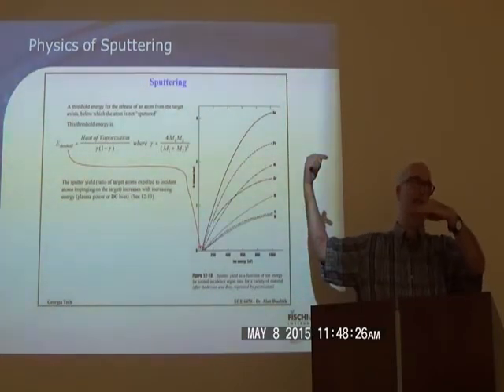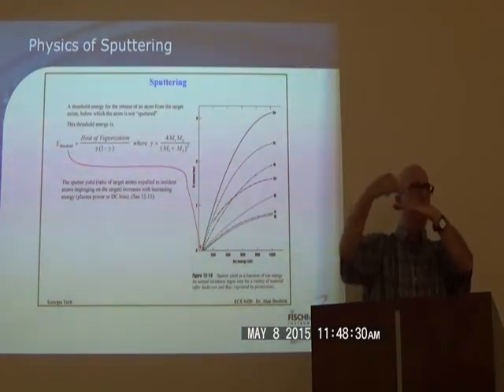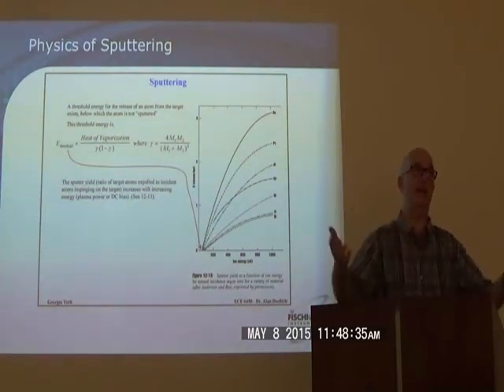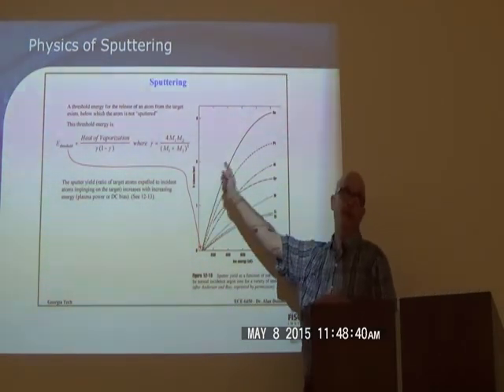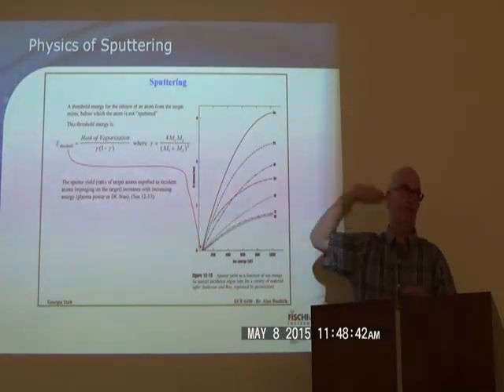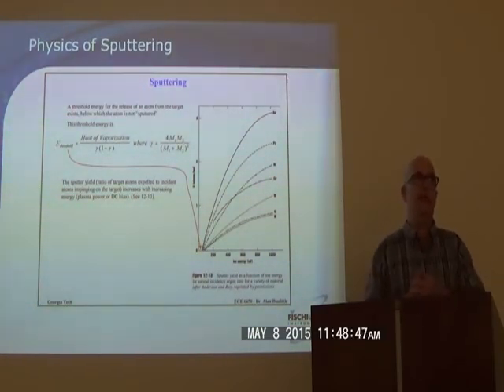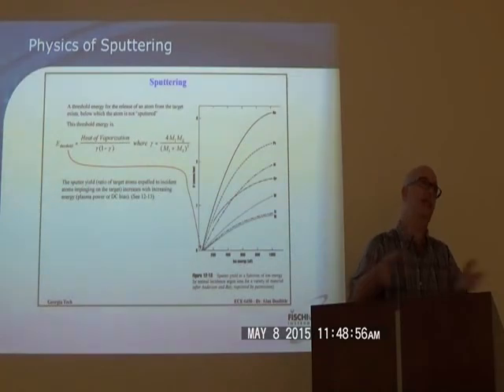It's statistical. The ion may hit here, and the ion that's sputtered could come from here, here, here, here. Most we can say is there's an interaction volume that occurs. So this applies to anything that follows basic Newtonian mechanics and physics. And of course, when you start talking quantum mechanical, then it's much more descriptive and more exact. And of course, some things like electrons that have almost no weight, I'm sure that the interaction volume will be much different than something that does.